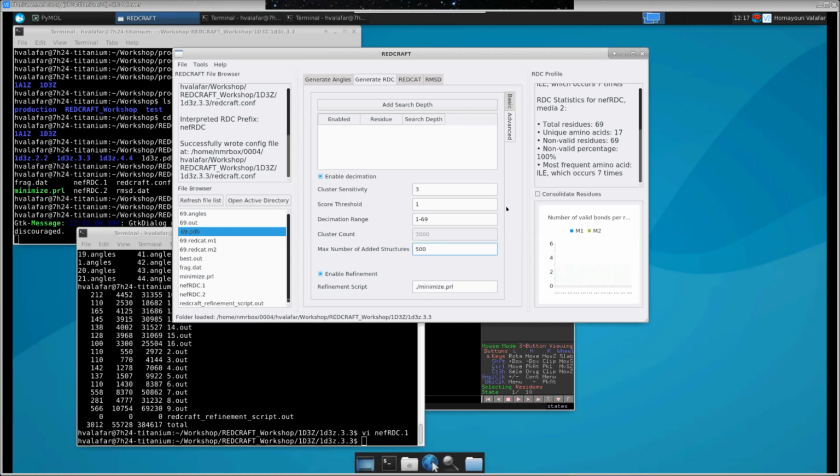Skeptics and critics of residual dipolar coupling will always be there. From my perspective, I'm more of a computational guy. I don't sit in front of the NMR instrument to collect data and observe the challenges of collecting data. I suspect the challenge in collection of RDCs is the additional alignment media that you need to create.